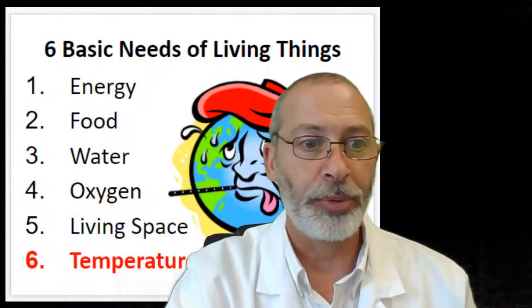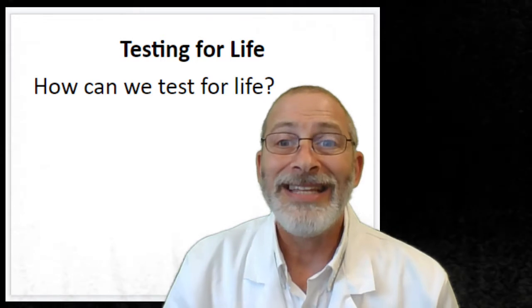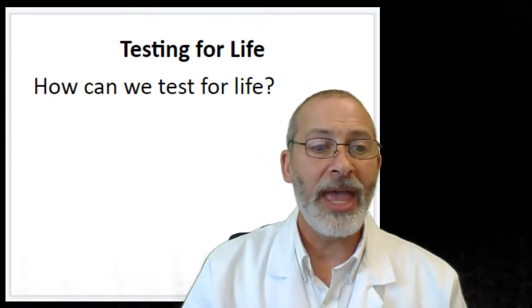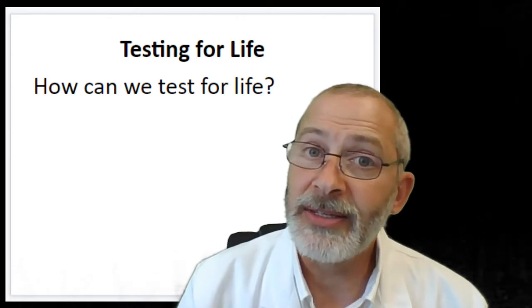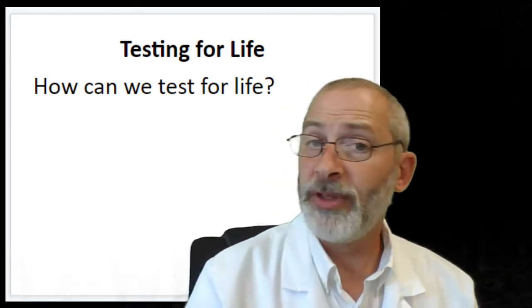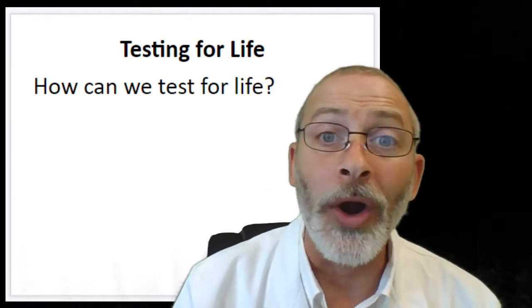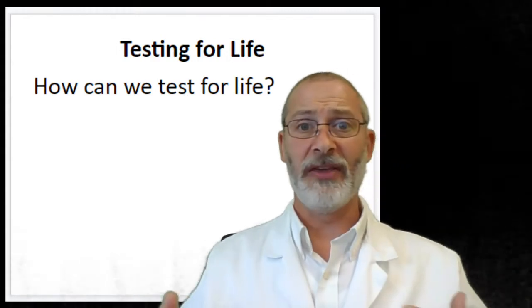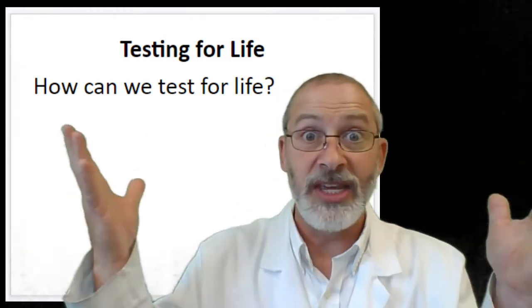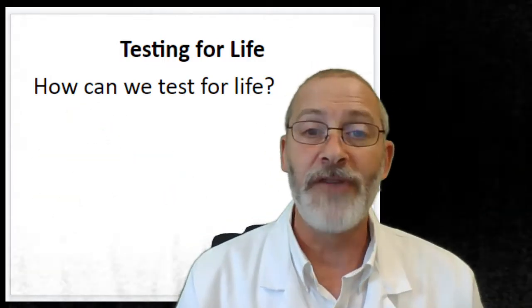Oops, a little preview there. Our lab activity has to do with testing for life. How can we test for life? How can we determine whether a sample of something has living organisms in it or not? Now, it's easy if it's a macroorganism like us that we can see and it's moving around, it's talking, it's performing all of those life functions and so forth.